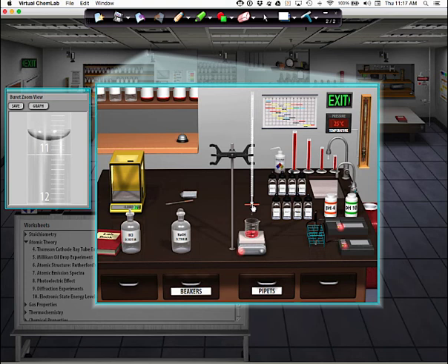But guys, guess what? That's actually good. Here's the way you do these. What I just did there was not a mistake. You always titrate things twice. The first time you titrate it, you have done what is called a gross titration. And I don't mean gross as in disgusting. What that means is gross means not very accurate. So the first time you do it, you just do it really quickly and you go past where you should have stopped. So look at where we're at. If you go over here and look at this window, we are at about 10.5 milliliters.